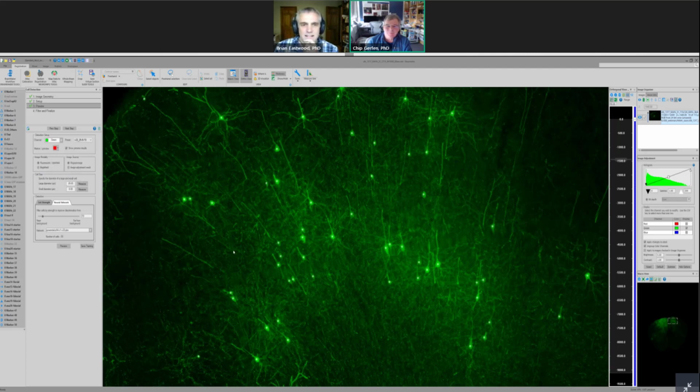Yeah. All right. Great. So you're using the same size parameters. You've lowered that pre-filter parameter, and so lots and lots of images are being passed into this neural network, and it's classifying based on what it has learned about what pyramidal neurons look like. And if you click back and forth in the cell strength tab, we still compute the cell strength, so we can actually look at the results that we would get from the cell strength at a particular threshold value, and then see what the neural network has done with those values.